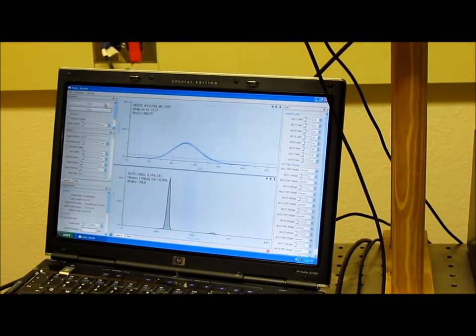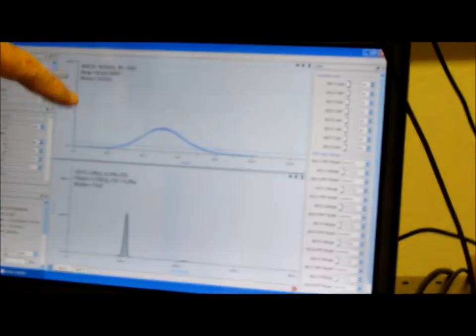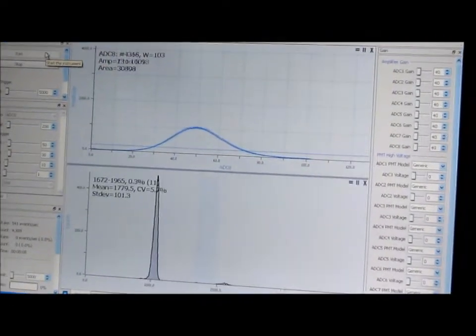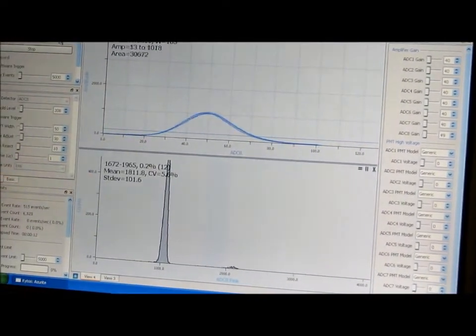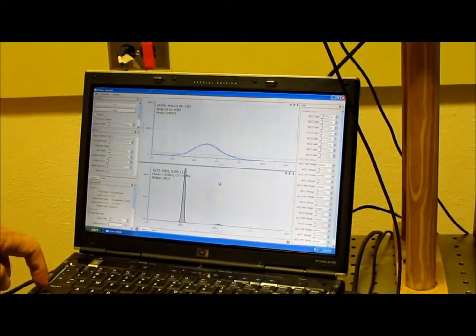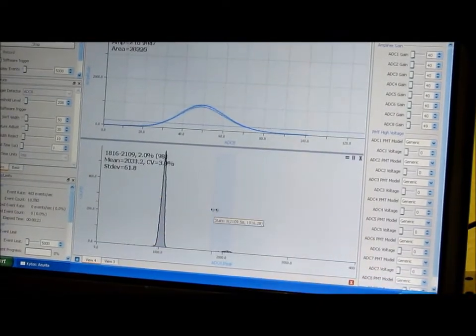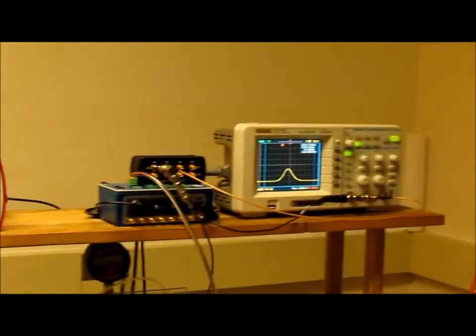which when we start it, you can see the digital representation of the waveforms that are the same as the analog signals on the scope. You can also see a histogram of peak. The Cytometer is intuitive, which makes it easy to learn and easy to run.